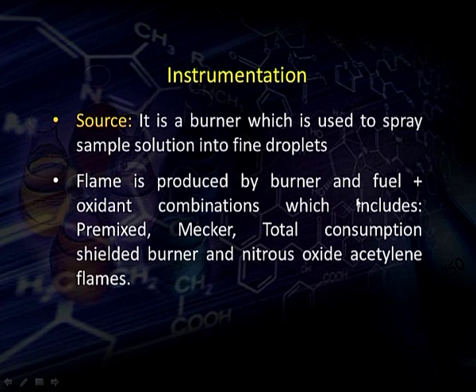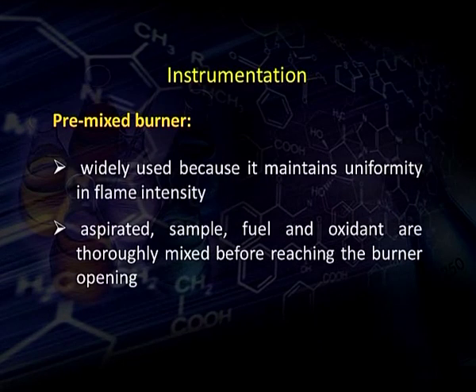Next is the source. It is a burner which is used to spray sample solution into fine droplets. Flame is produced by a burner and the fuel plus oxidant combination, which includes premixed, Meker, total consumption, Shielded burner and nitrous oxide acetylene flames. Premixed burners.